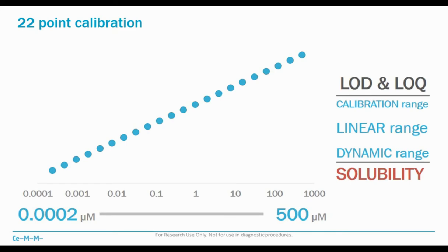And this experiment would allow us to first of all assess the limit of detection and limit of quantification for the method, because we would really see where we lose the sensitivity or where we approach the limit of detection. It also would give us very valuable information about calibration ranges, meaning we would know where our samples stand in this range of concentrations.